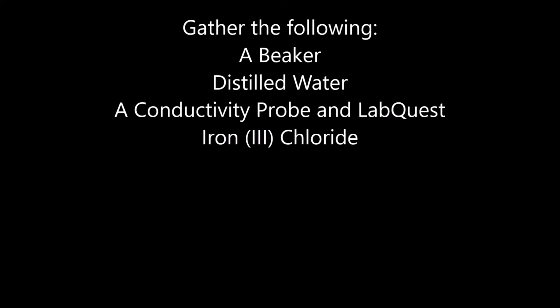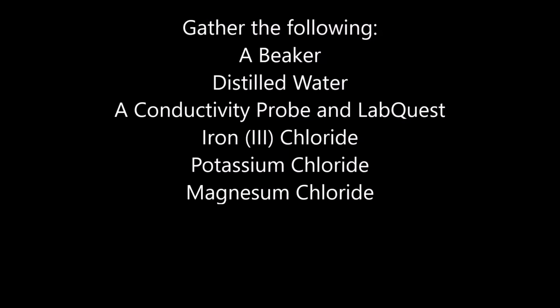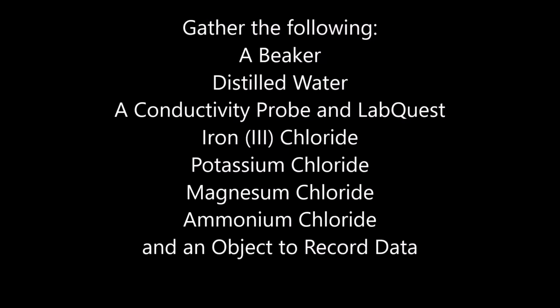To figure this out, the following must be gathered: a beaker, distilled water, a conductivity probe and a LabQuest, iron 3 chloride, potassium chloride, magnesium chloride, ammonium chloride, and an object to record data with. Once those have been gathered, you can proceed with the following lab.